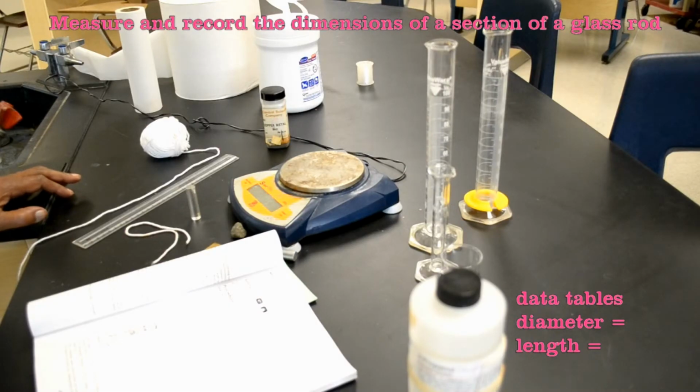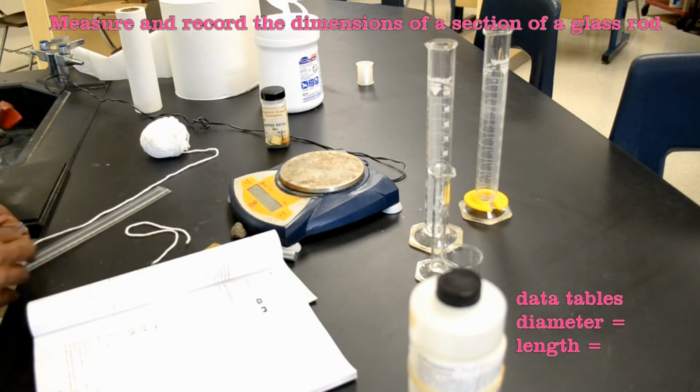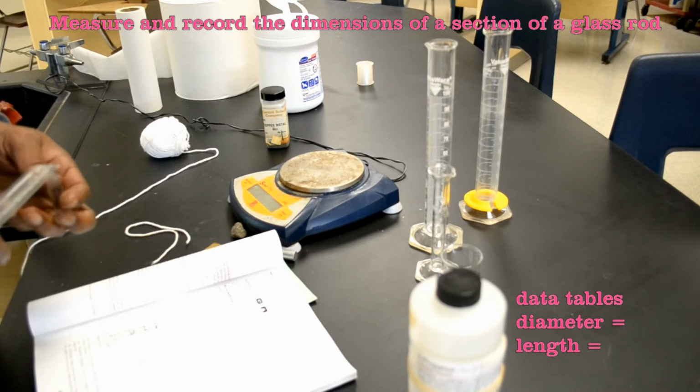Now for the procedure. Measure and record the dimensions, diameter, and length of a section of glass rod. So I'm going to measure the diameter first.